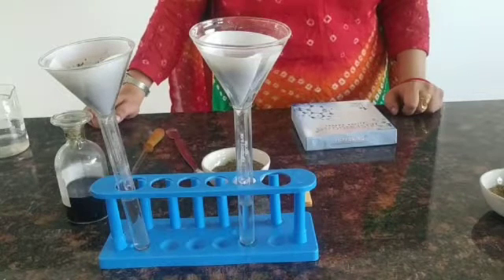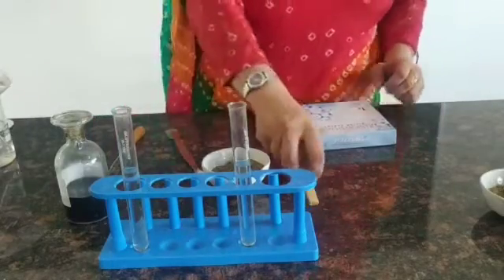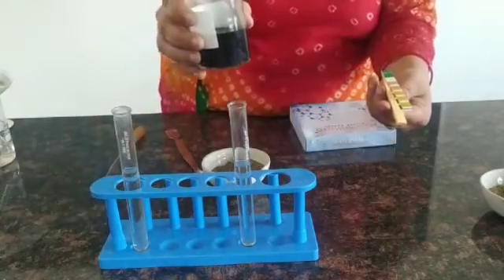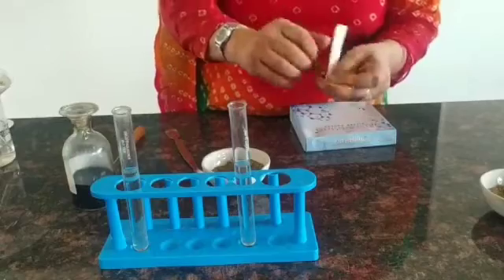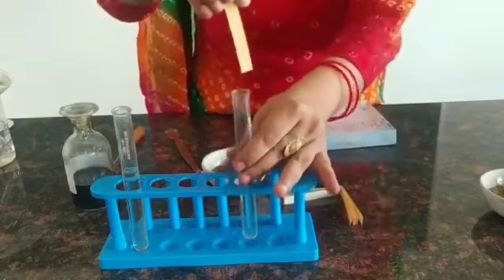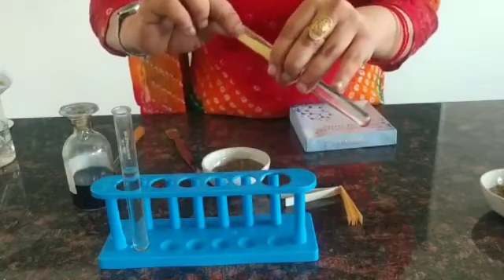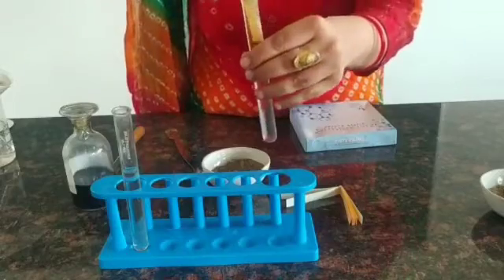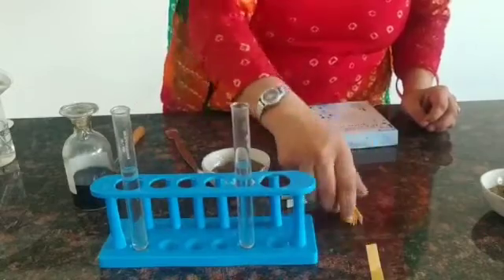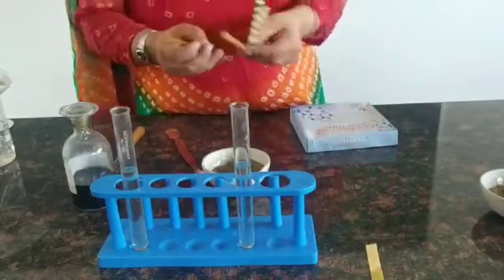When the water passes through, it is collected in the test tube. Now we are going to take the pH paper. We will use the universal indicator also. We'll take a strip of pH paper and dip it inside the first test tube, let it dry for some time, and then check the pH by comparing it with the pH chart.